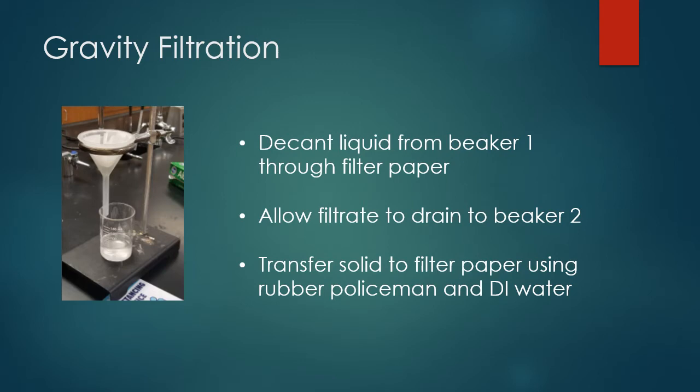We want to allow the liquid water to pass through without solid present. Once we get most of the water decanted, we then use a small amount of water to transfer all of the solid onto the filter paper. To aid in this, we use a rubber policeman and a little extra DI water. Once all the water has drained through, we now have the water in beaker two. This isn't just water because one of those three compounds is soluble in water. To figure out that compound, you'll look at the solubilities. We now have one of the compounds completely isolated in water. The other two compounds are solids trapped in the filter paper.